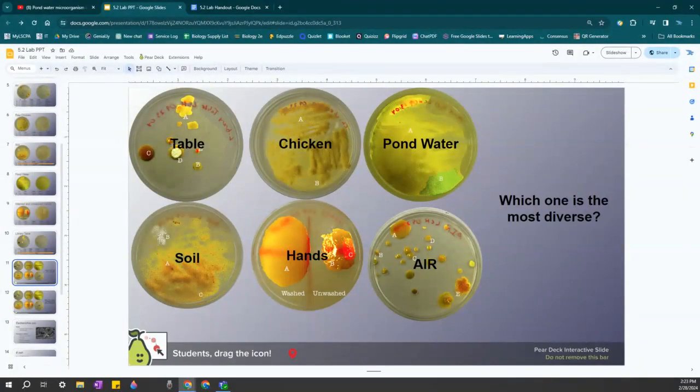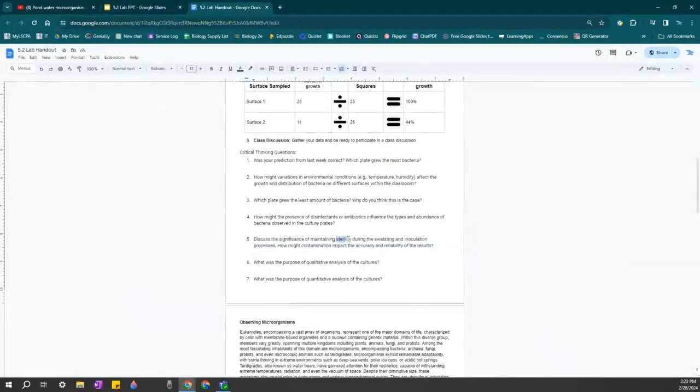For instance, this fungal growth is evidence that there might have been some contamination with that fungus, or that fungus was growing on the surface that we swabbed. So contamination of the results is our main concern with maintaining sterility. We also want to make sure that we are keeping ourselves protected from any pathogens.